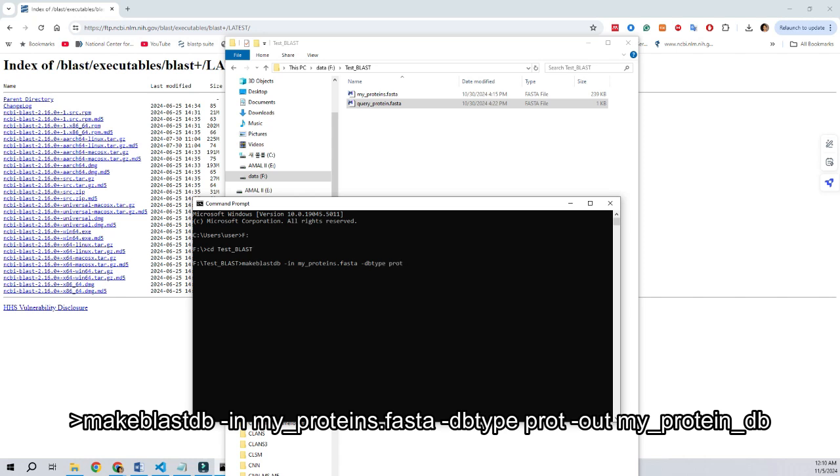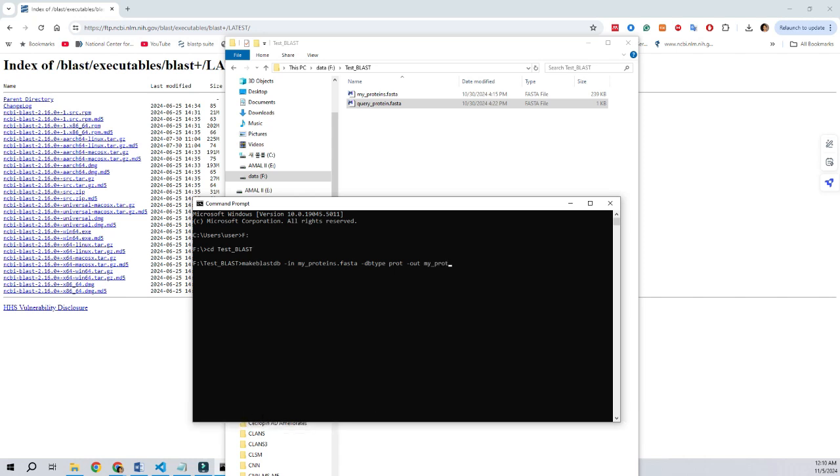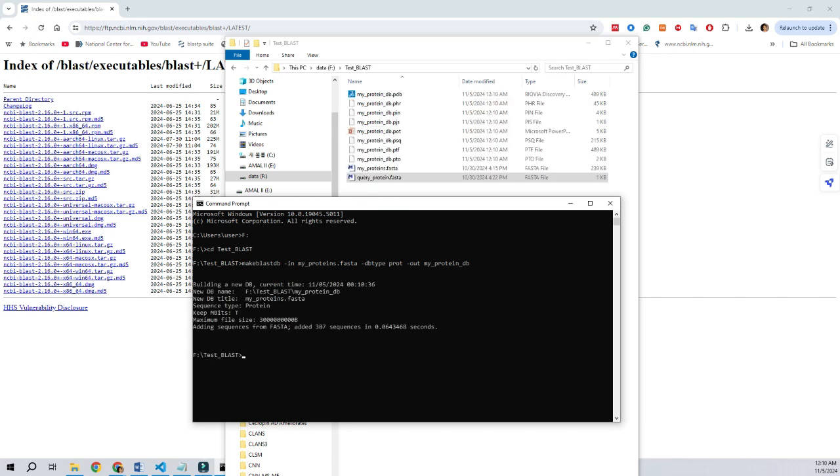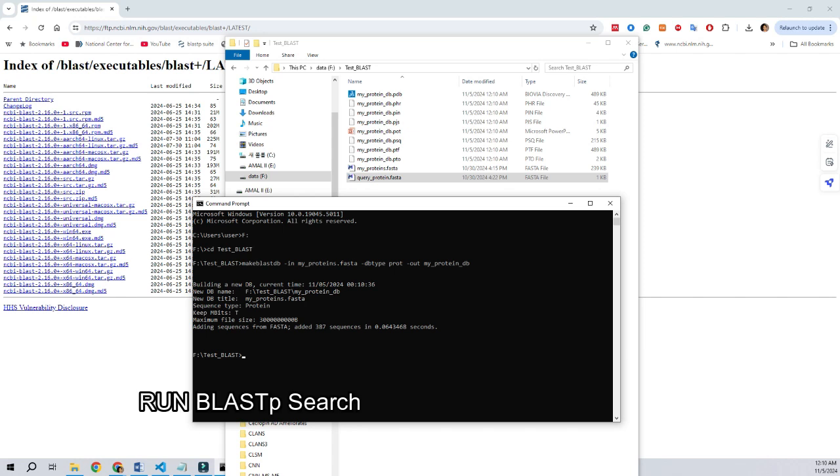Here, dbtype prot indicates that this is a protein database and its name is going to be myprotein db. Once you execute the command, the database is prepared. And next, what we have to do is do the BLAST search using a query or input sequence.